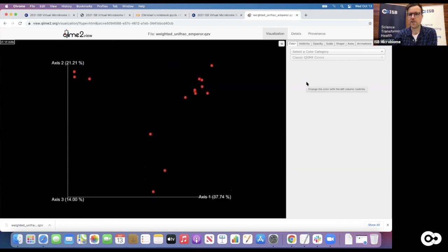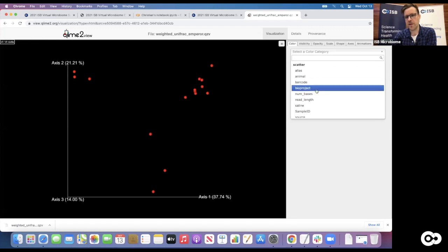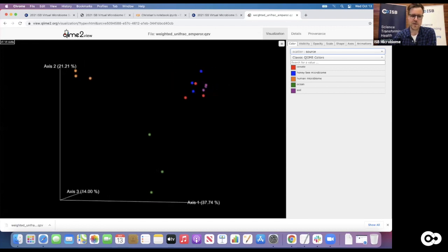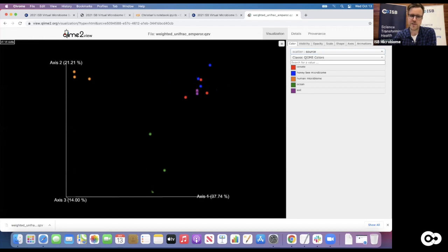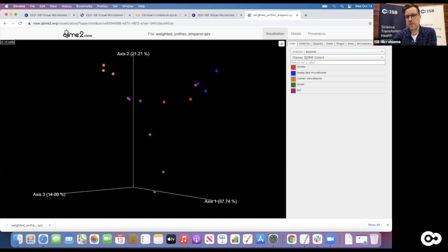Now we might be interested in the metadata we added - we can color the points based on certain conditions. For instance, the 'source' variable tells us which environment each sample came from. Now we see the points colored by their environments. Ocean is somewhat separated on the bottom - they're still quite different from each other but in their own group. The human microbiome is also kind of different, but there are some surprises.